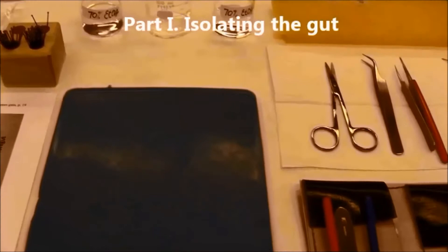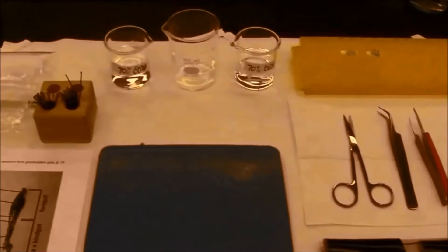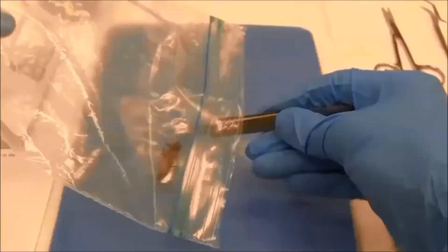To dissect a grasshopper I will need a small dissecting pad, a standard dissecting set which includes scissors, forceps and a scalpel, micro centrifuge tubes, ethanol, insect pins, and a scheme of a grasshopper's internal structure.